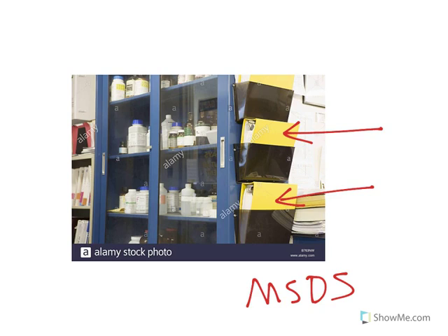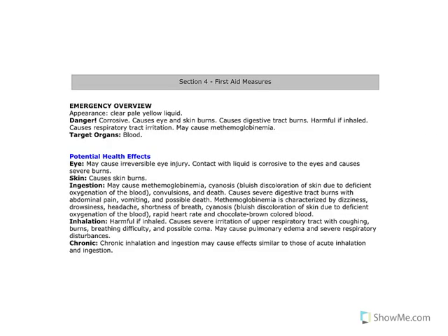You can also probably more easily look it up on your phone. If you type in bleach plus MSDS, what is going to pop up is a standardized form, and this one is for bleach right here. So we spill bleach. First aid procedures.